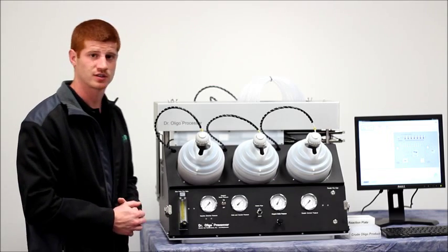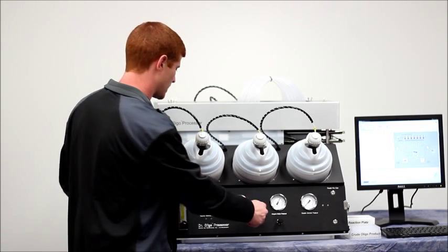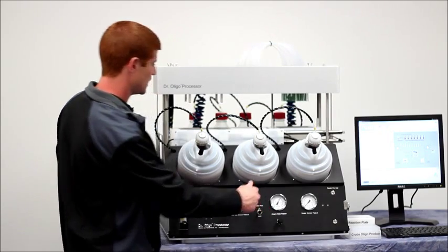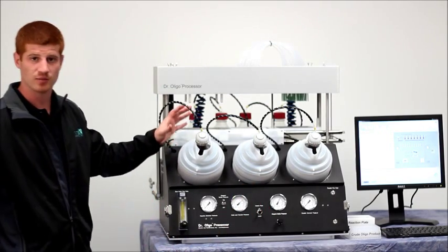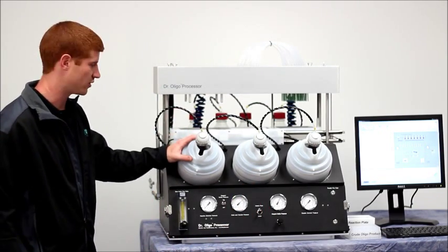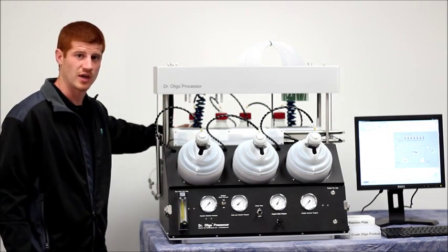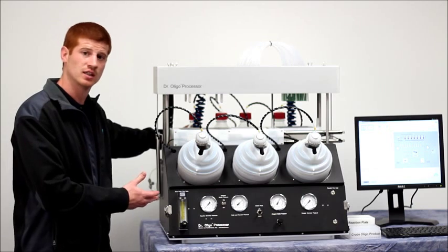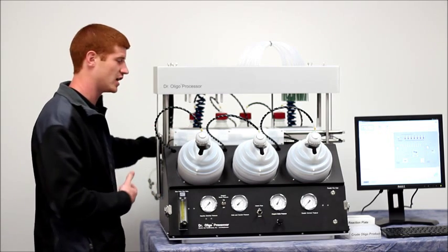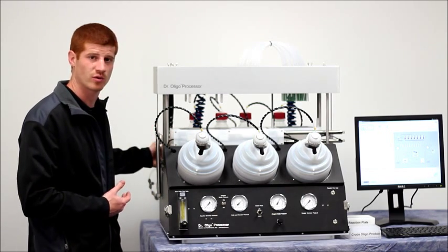So let us begin by opening this up and taking a closer look. As you can see, the three main bottle reservoirs here are on the front of the instrument. In addition to that, you have four here in the back for a total of seven. We can customize up to a total of eight total reagents depending on whatever process you're running.